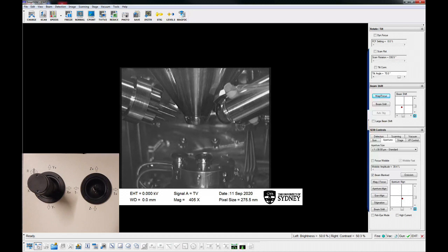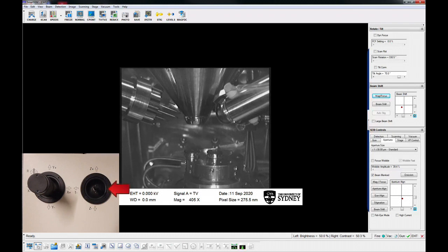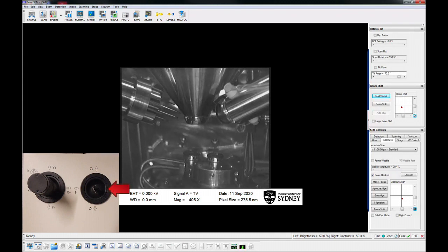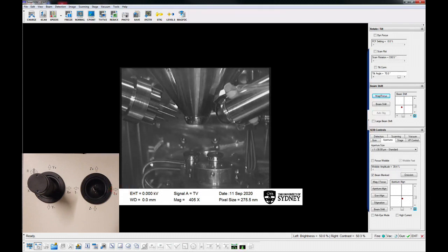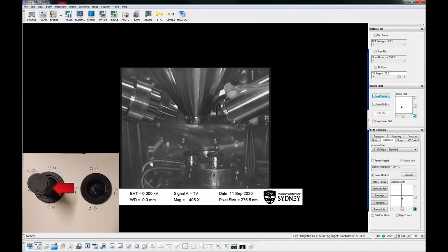There are two joysticks that control stage movement. The thin one moves the stage up and down and tilts the specimen. The larger joystick controls X and Y motion and rotates the stage.